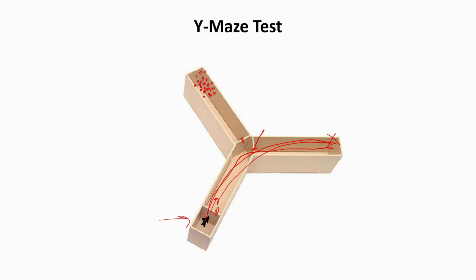At the same time, you will tell the subject that if you go here, you are going to find the food the subject is looking for. So you have to train your subject for days, weeks, and months to go left and right, left and right, left and right. And you do this test with the zebrafish subjects whom you are going to put forward for a neurodegenerative disorder, for example Alzheimer's, Parkinson's, or whichever disease you are working on which concerns behavioral assessment, and specifically memory based behavioral assessments, right?